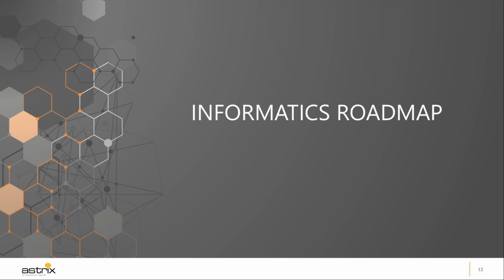So we always counsel clients that it makes a lot of sense, and it'll make your informatics journey a lot easier, a lot more pleasurable, if you just take the time to do a little planning. And that can come in a variety of different states. I'll talk about that. But when we talk about informatics strategies, really what we're talking about is developing an informatics roadmap. And this roadmap can really start at any time. You don't have to be a fully paper-based operation in order to plan it out. You could have a system or two or three and go through this roadmap. At that point, it would just be looking at the systems that you have, how you are using them, maybe changing that a little bit before you lay out the whole plan.